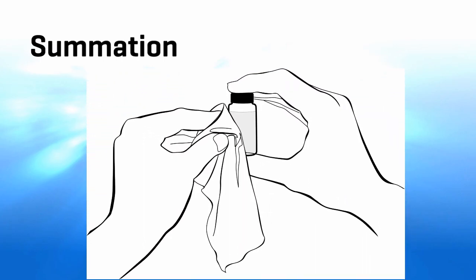Another thing about the tubes is that, again, it's about shining light through that glass. So anything that obstructs that is a problem. Make sure you keep the tubes clean. If they have smudges or marks on the outside, that's going to affect your reading. So you need to keep a lint-free cloth around and try to keep those as clean as possible.